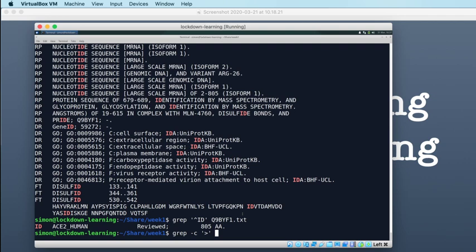And you do this by counting the lines which have the greater than symbol in, because the fasta format is that sequence IDs start with a greater than, and then you get the identifier on the rest of that line, and then the sequence happens on all of the lines underneath that, and then your next sequence starts with a greater than symbol, and so on.